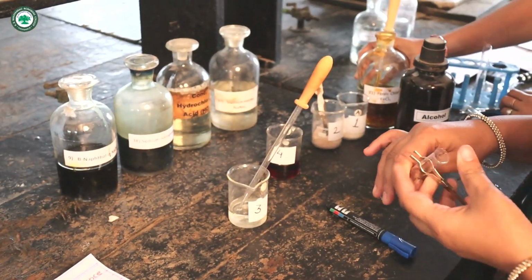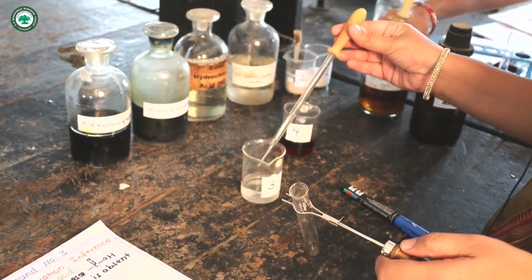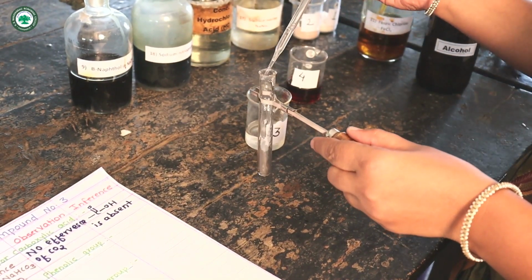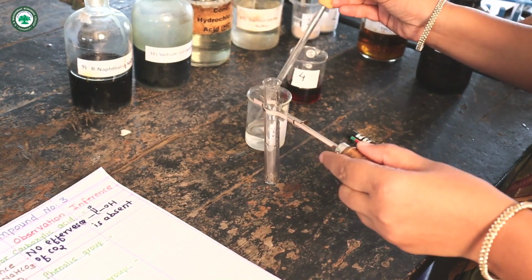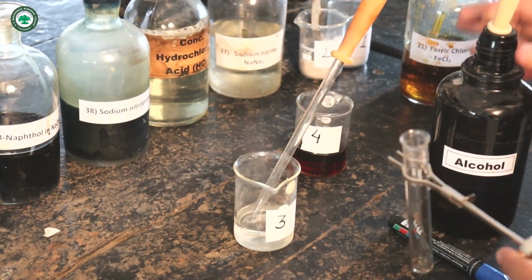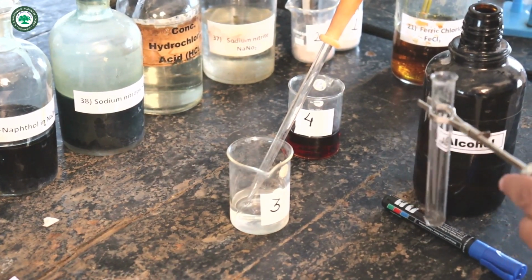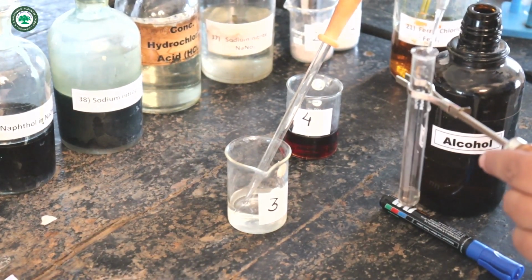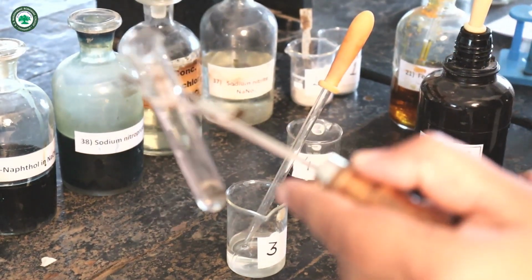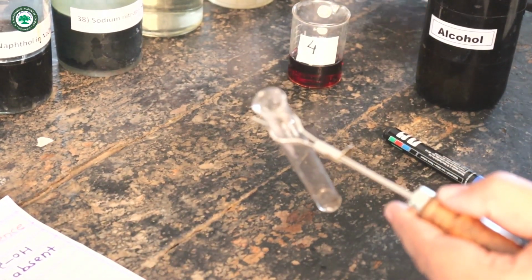Then next test for phenolic. Take a small amount, 1 to 2 ml, of compound third in a test tube. Then add alcohol, shake the test tube, then add neutral FeCl3 solution.